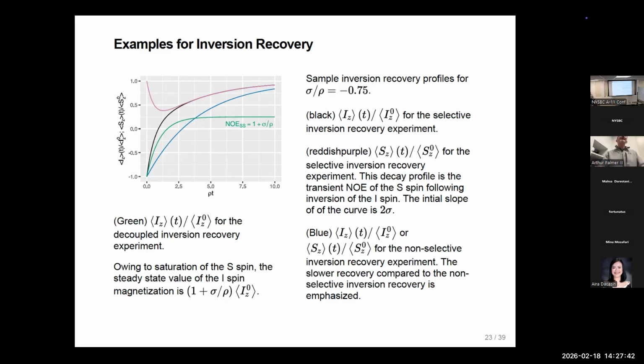If suddenly it takes 8 or 9 seconds, that's a huge lengthening of how long it takes to do the experiment. So unless there's a good reason to really deuterate all the methyls, and sometimes we have to, having some protons around to help get around this non-selective inversion recovery problem can be a big help.